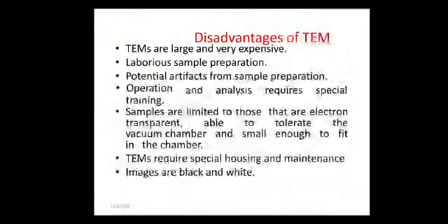As I told, sample preparation is a laborious process. So how are we going to prepare the samples for TEM analysis? First, we need to fix with a chemical product. Then we rinse and stain with chemical products, and treat the composites with heavy metal compounds, and go for dehydration with organic solvents like acetone and ethanol.